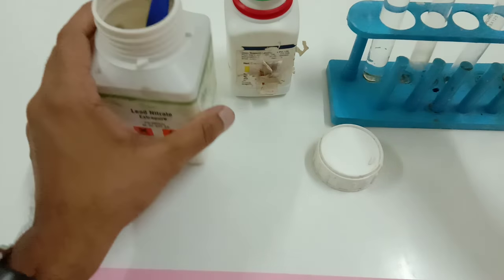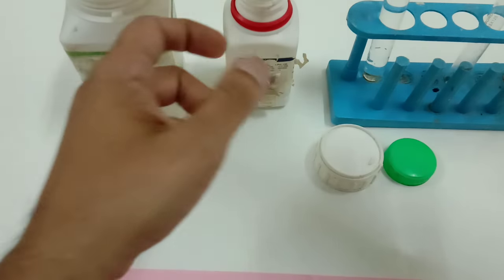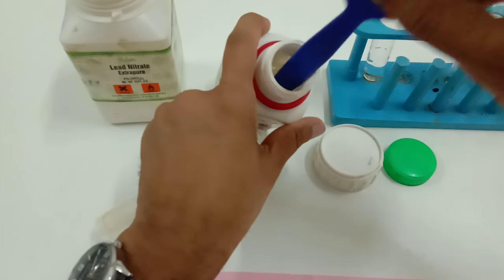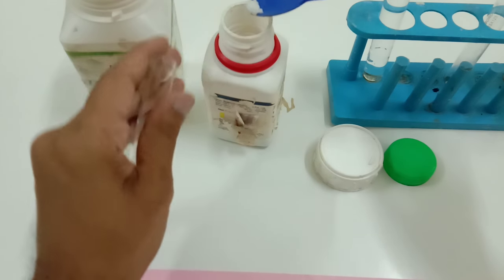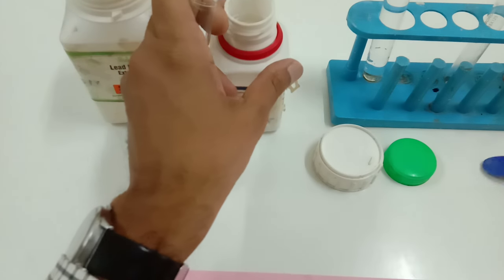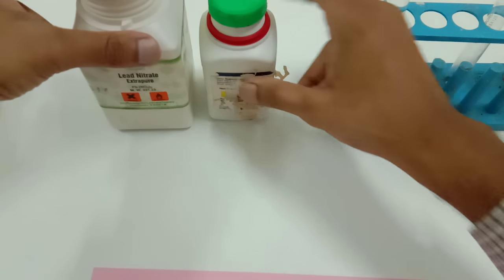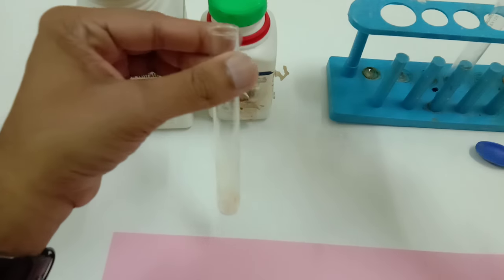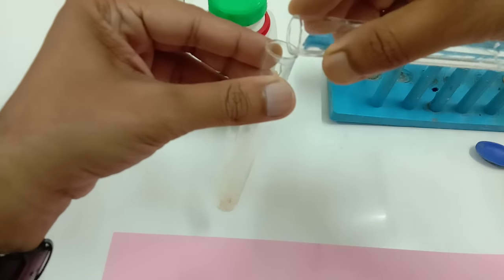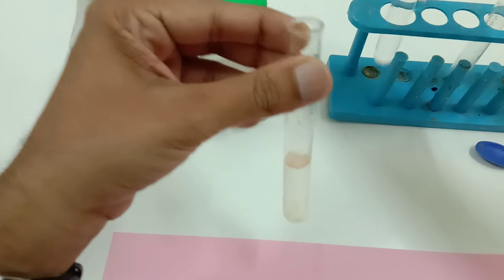Then in another test tube, I am going to add potassium iodide, that is again a white color salt. Now in this potassium iodide, I am going to add water so that this becomes the aqueous solution of potassium iodide.